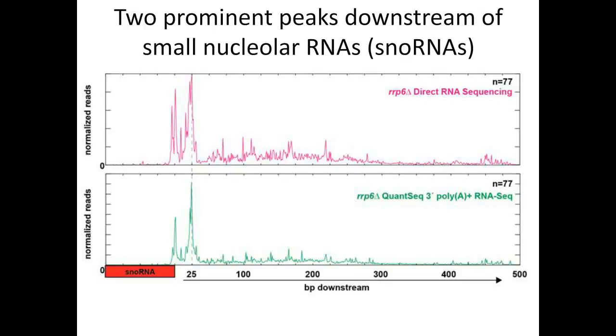And so here we can see that the two methods, direct RNA sequencing and the QuantSeq sequencing, actually give pretty good agreement in the relative location of these peaks. We can see one peak right at the mature 3' end of these snoRNAs, and we can see another peak 25 nucleotides downstream. After that, we see this broad range of signal.